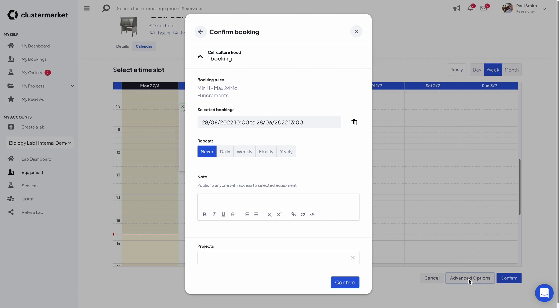When you do this the modal will open up and you will see the recurring bookings functionality here under repeats.